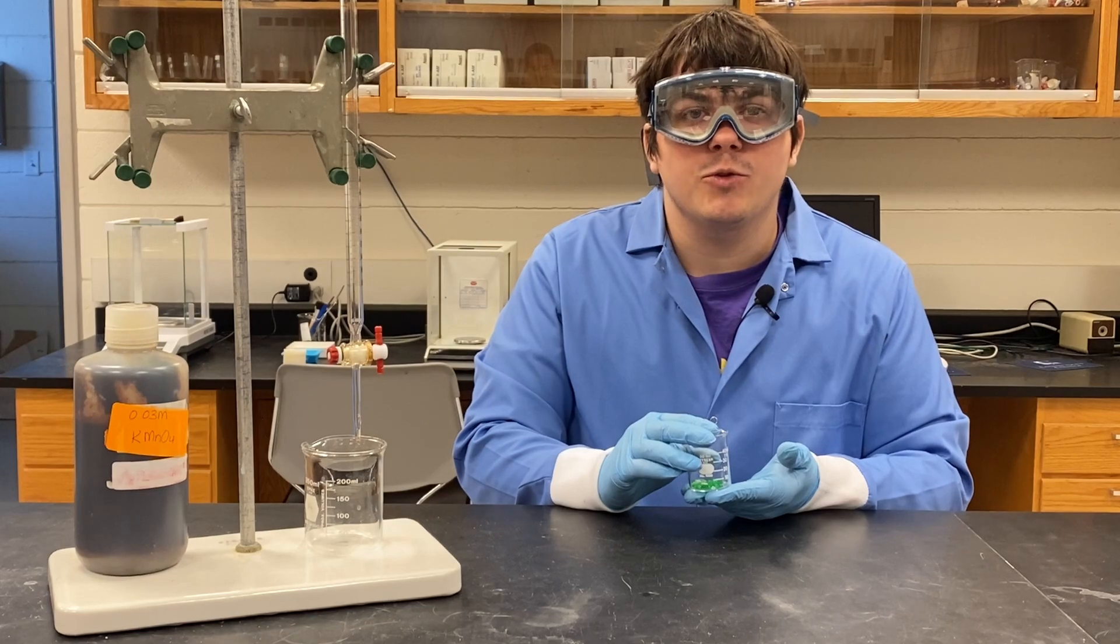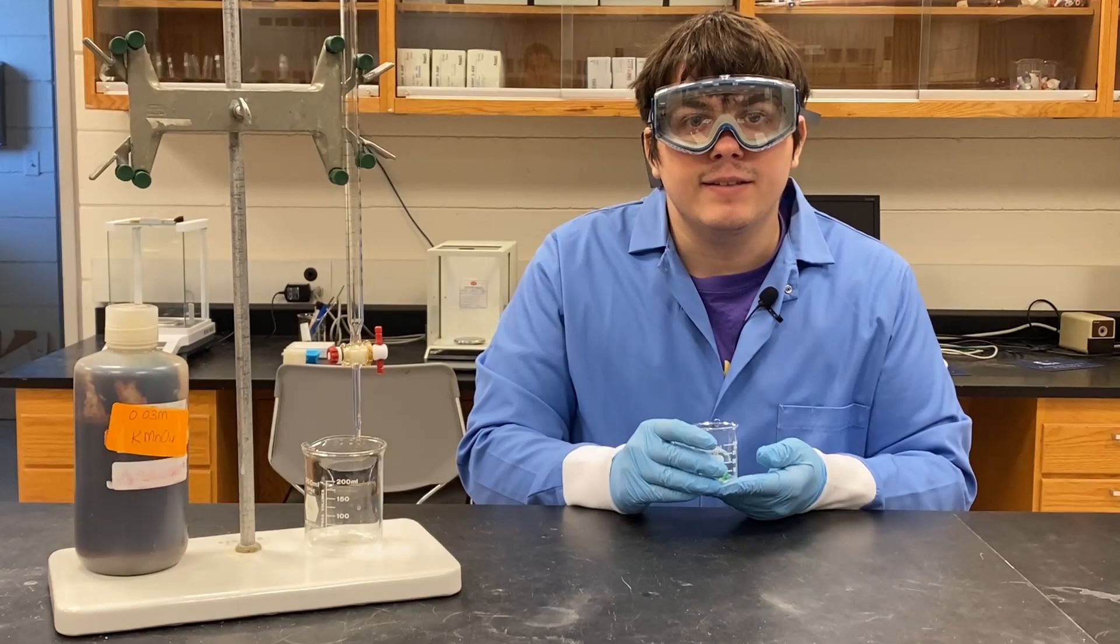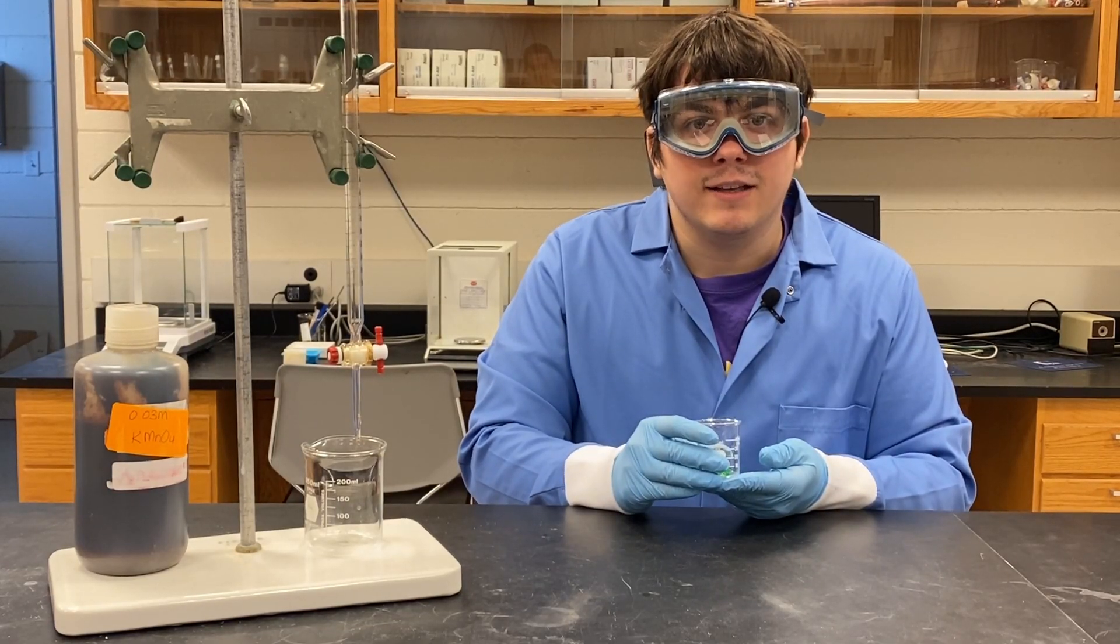Now the same type of titration is repeated, but you will be using your green crystals instead of sodium oxalate. This titration of the green crystals will allow you to determine the percent oxalate in that sample.